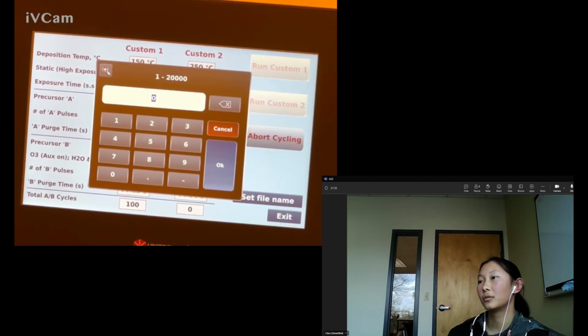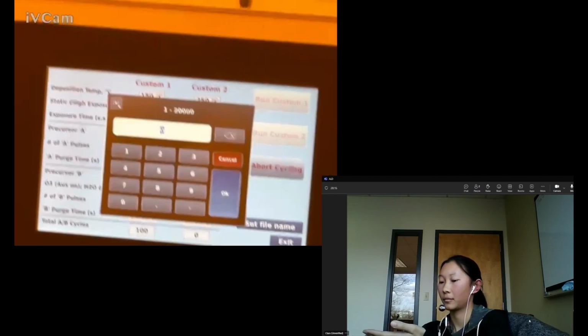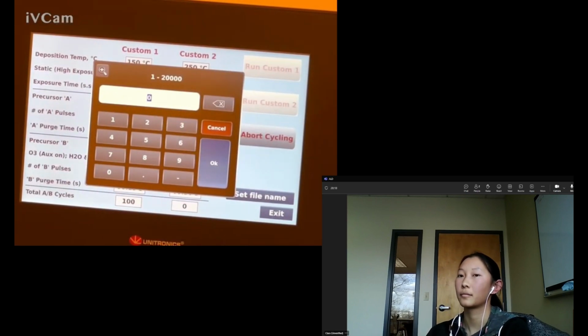Is that a continuous film? Do you get, that's the compressor. That was the air compressor that turned on. So is it a continuous film, or does it start off as isolated particles? And how does it work with platinum? I never.